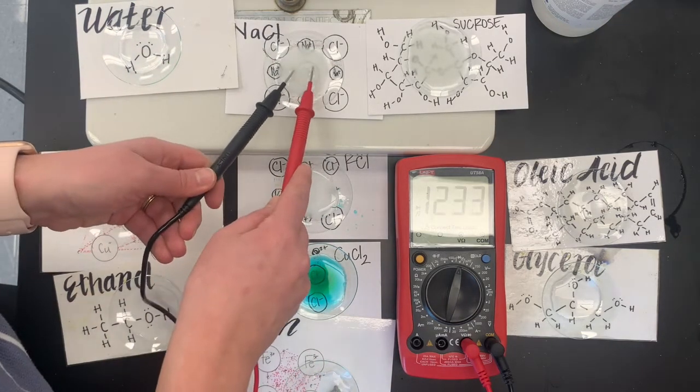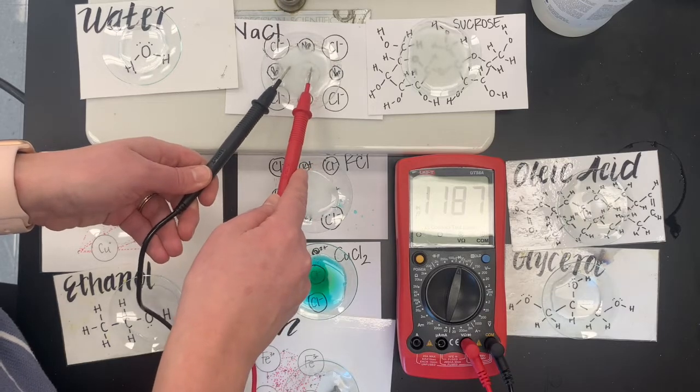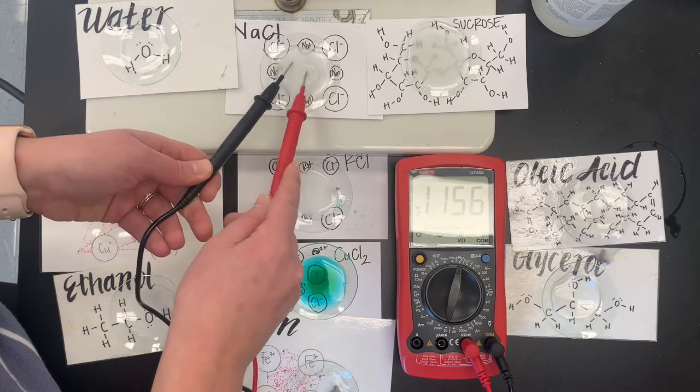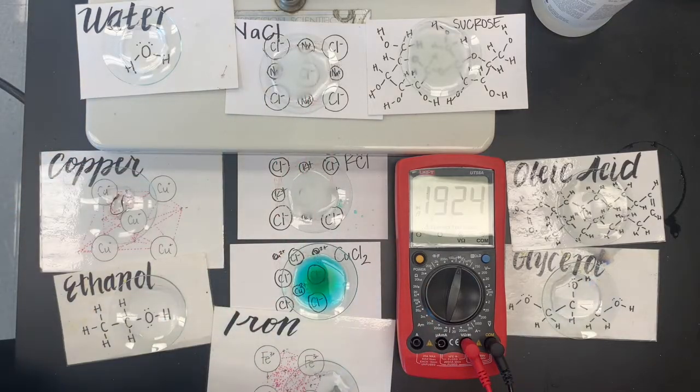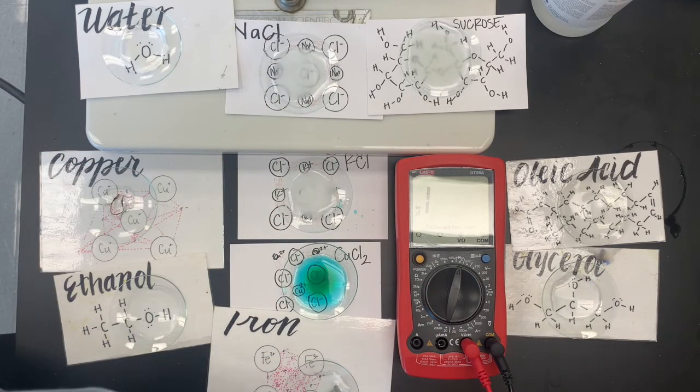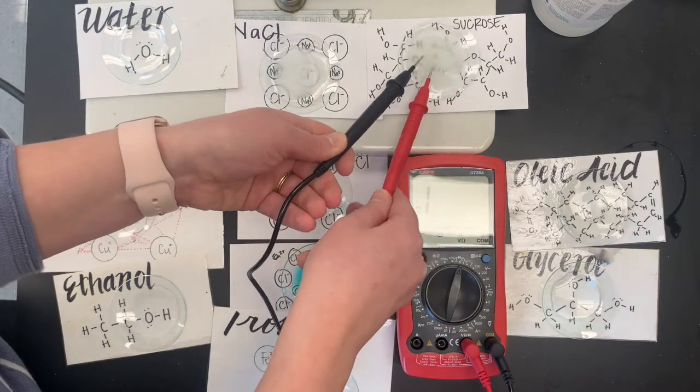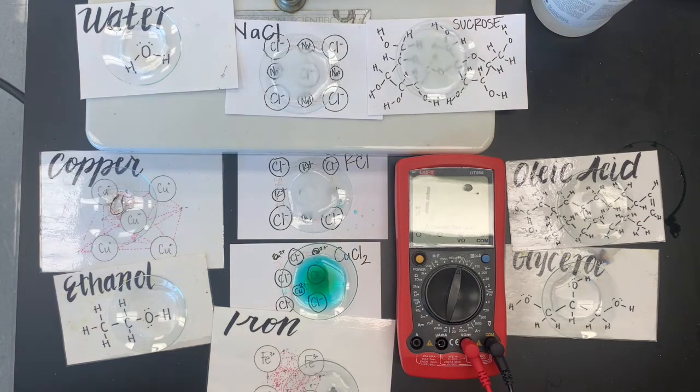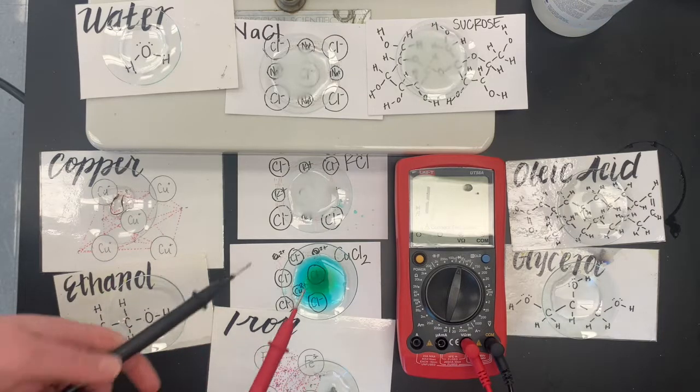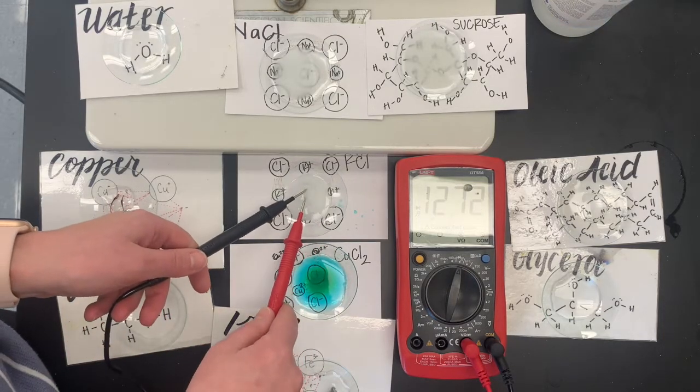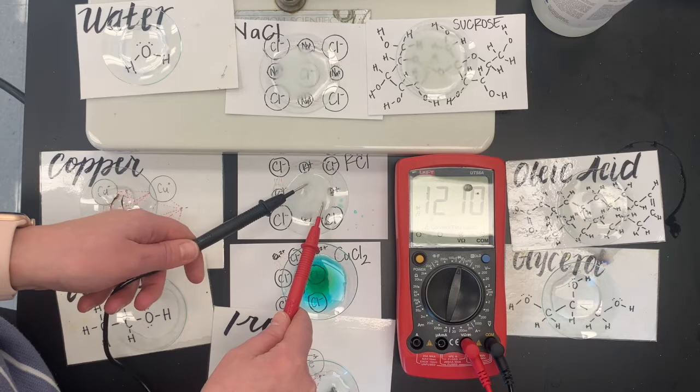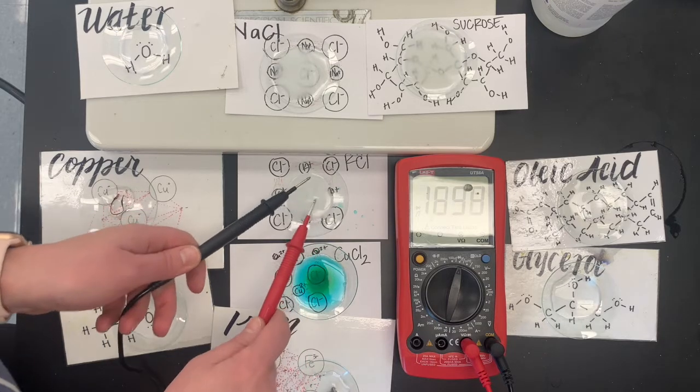Sodium chloride. It's not beeping, but did you see the number jump on the multimeter? Yeah. We're seeing a big thing there. So I would say I would give that a yes. Let's see what other data we can get. Let's look at sucrose. So I'm just seeing a one, no change. Again, I'm cleaning off my leads between each one. So copper, it didn't really dissolve. So that shouldn't count. KCl. Again, seeing a big jump in numbers.